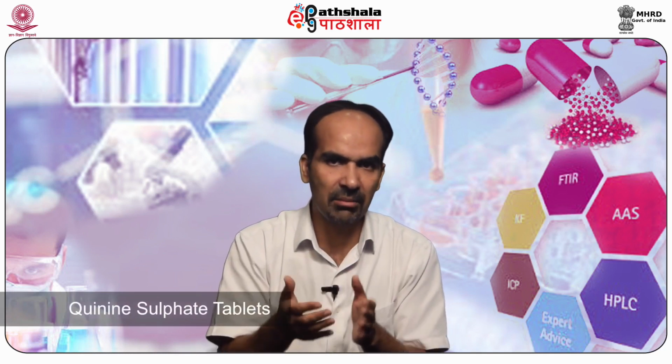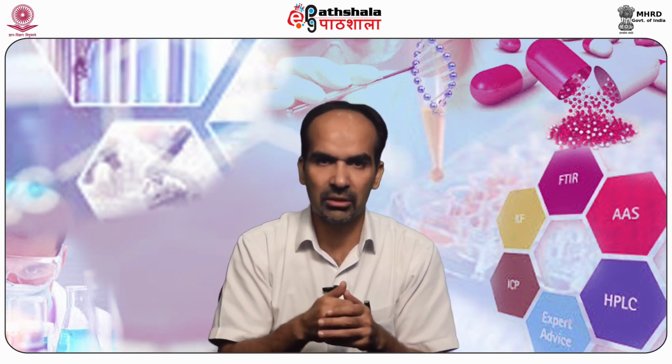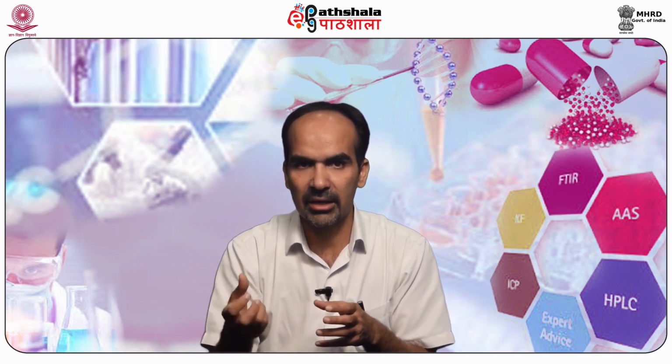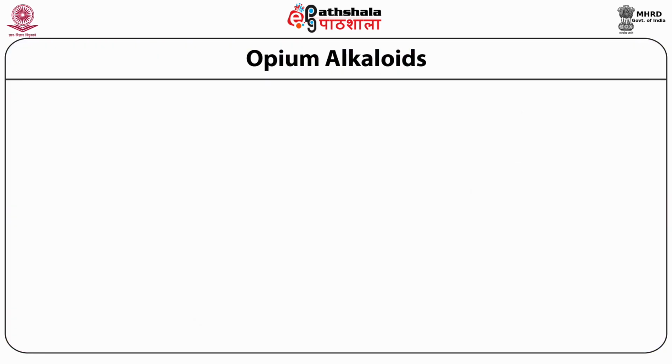Quinine sulfate tablets and quinine bisulfate tablets are extracted with water and dilute HCl, and from the filtered solution, the alkaloid is liberated by ammonia and extracted with chloroform. The liberation with ammonia and extraction with chloroform are also used for quinine and urea USP and quinine and urea injection USP.